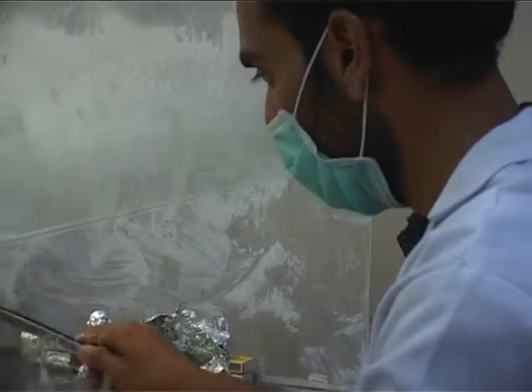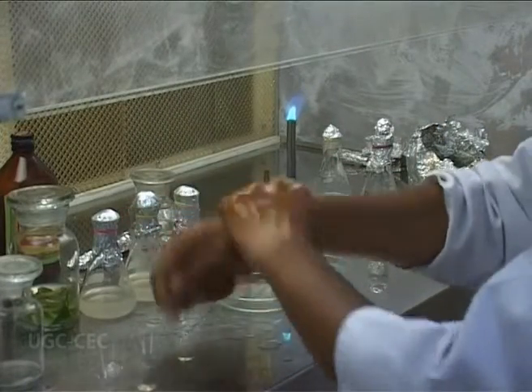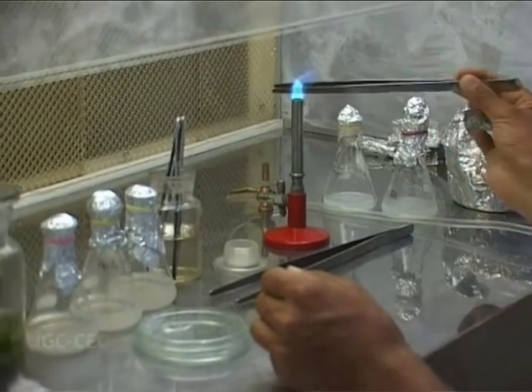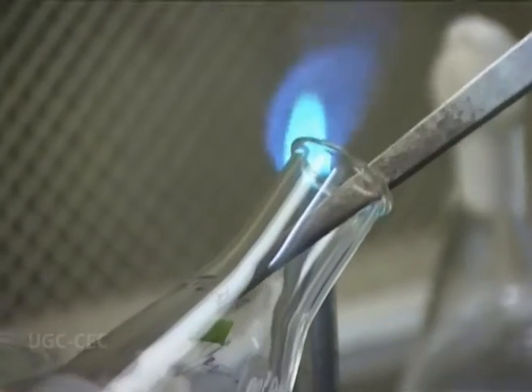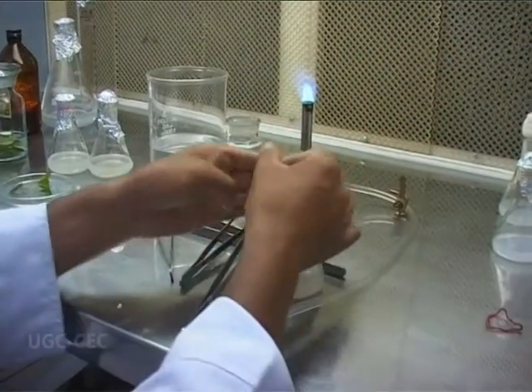In order to maintain aseptic conditions, all the culture vessels, test tubes, and pipettes should be opened only in laminar airflow. It is also very important to wear an apron and mask. Hands can be sterilized with alcohol. All the instruments used during the transfer process are flame sterilized after dipping them in alcohol. The culture vessel is opened near a flame. The explant is placed into the medium and immediately the culture vessel is closed again.